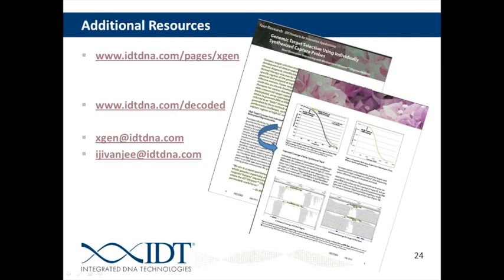Now with RNA viruses, it's a little more challenging because of the high rate of mutation that occurs within these replicons, and so you want to make sure that you're using a sequence that is targeting the majority of the viruses that are present in the organism that you want to enrich for.